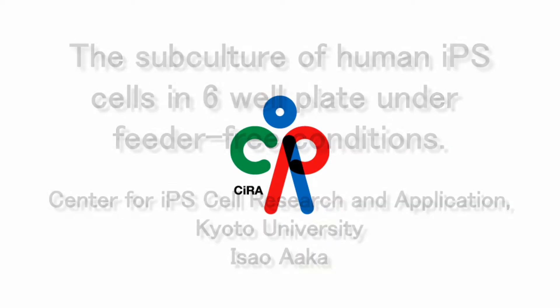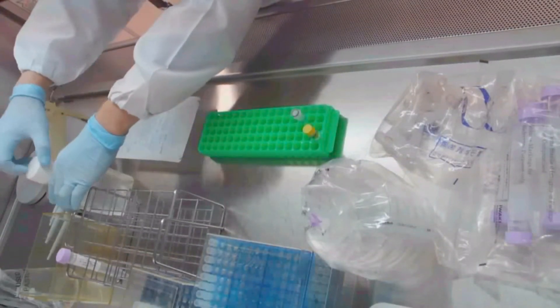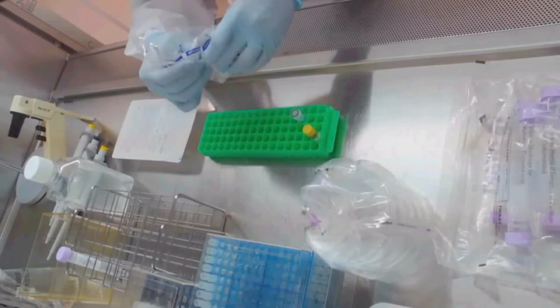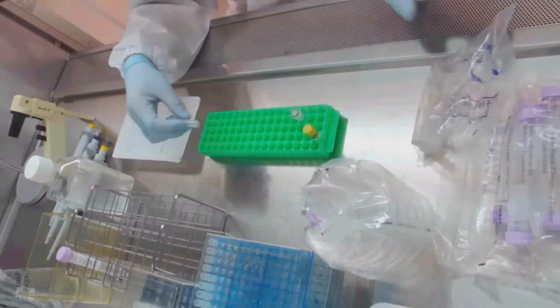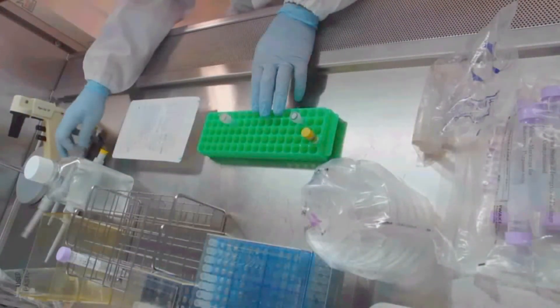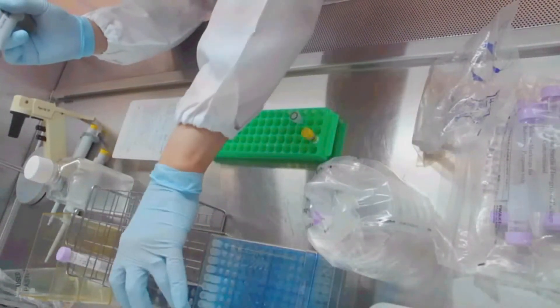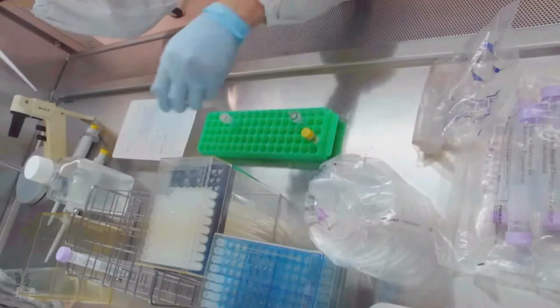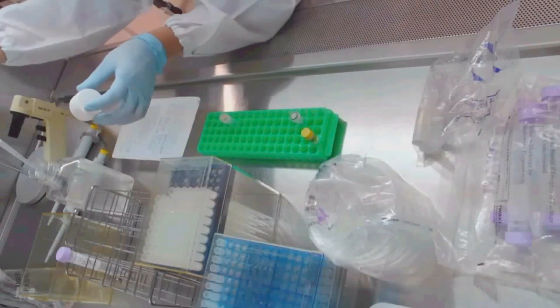This video explains how to subculture human iPS cells cultured in a 6-well plate under feeder-free conditions. One well of a 6-well plate should be previously coated with 9.6 µL of laminin 511 solution in 1.5 mL of PBS and incubated at 37 degrees for at least 1 hour.